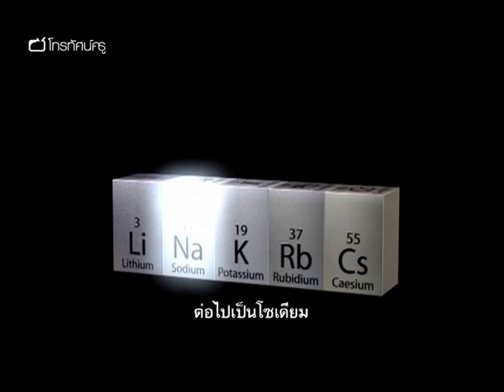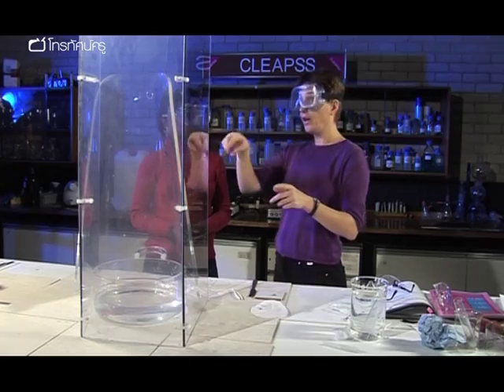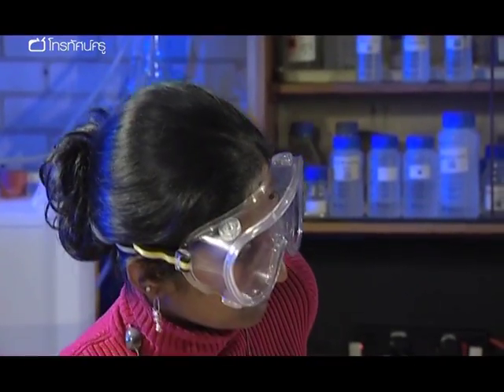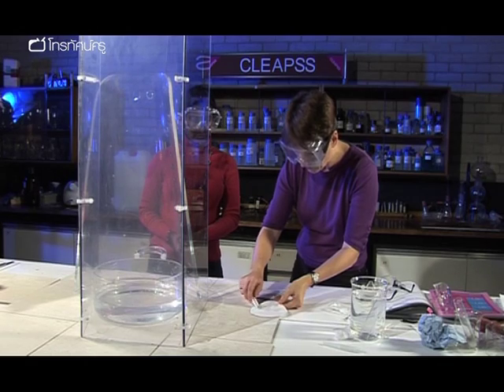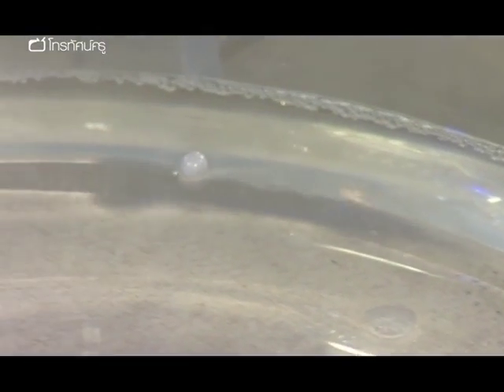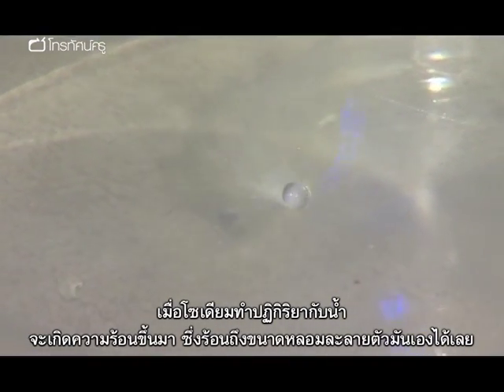Next up was sodium. This time we've had to take slightly more careful safety precautions. Got the big screen round the front and round the back. So this time we're protecting not just the pupils, but ourselves as well. Okay, so let's have a go with sodium. When sodium reacts with water, it produces so much heat that it melts the metal.